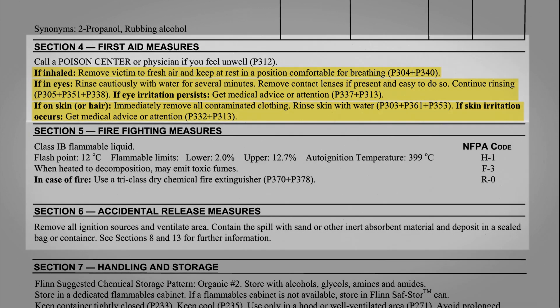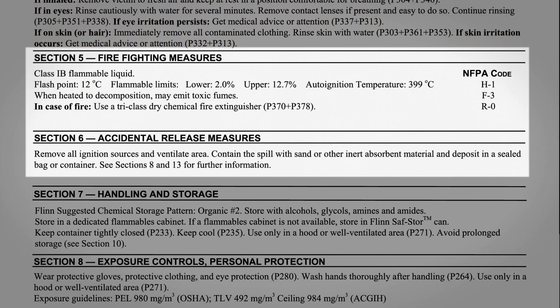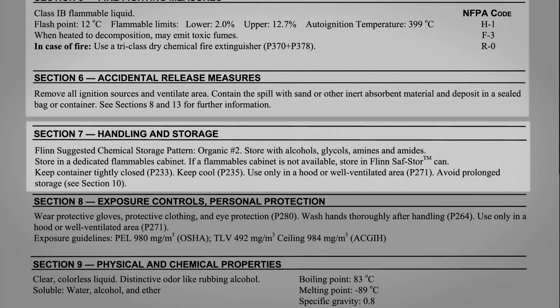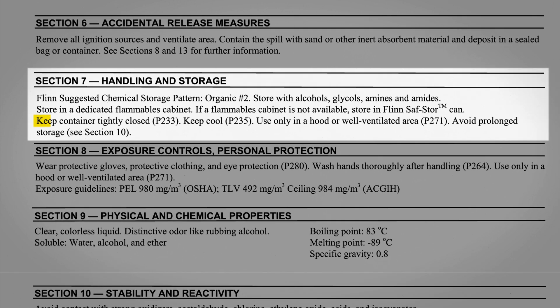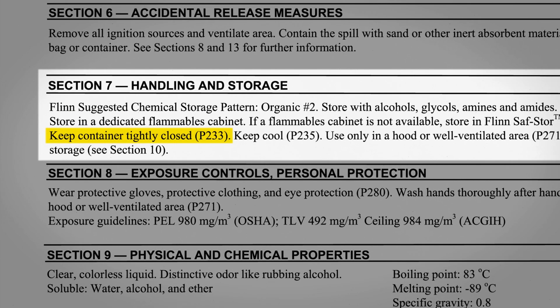Sections 5 and 6 contain reference information for firefighters and other emergency personnel who respond to a fire or chemical spills. Section 7 describes ways to minimize risk when handling and storing a chemical. Many of these recommendations are in the form of standard precautionary statements, such as P233: keep container tightly closed.